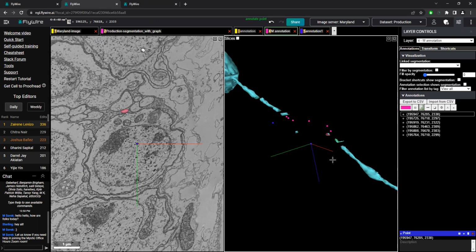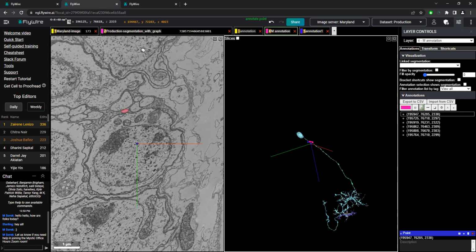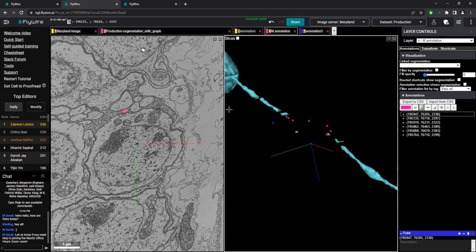Yeah. So feel free to use the annotation points. You already used them a little bit here, but drop them where you need them. And what I've done, as you can see, is add a few more layers so I can change the color if I know that's where something is that I'm following.